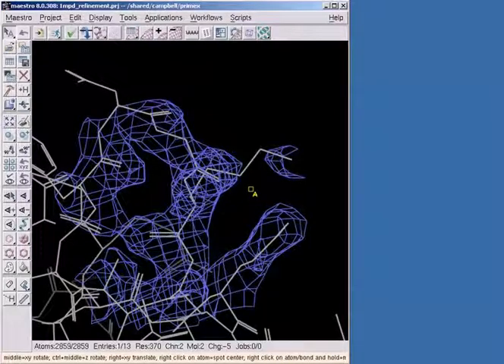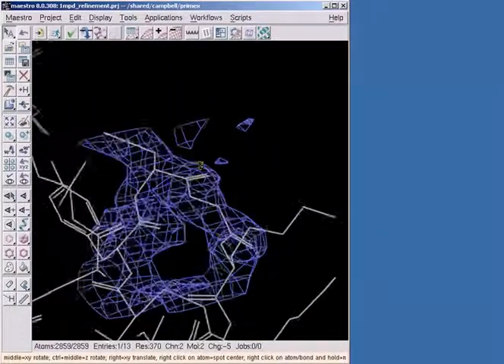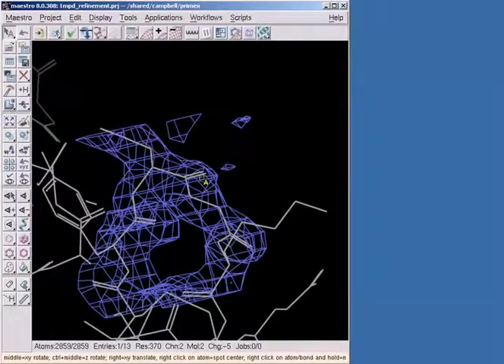Doing so will center the residue in the workspace and display the map surface in the vicinity of this residue. Right-clicking on the next residue in the protein backbone will recenter the workspace contents accordingly, and the map that we've calculated is now visible in the vicinity of this newly centered residue. In order to increase or decrease the surface ISO value, we need only click on the appropriately named buttons in the Primex toolbar, like so.